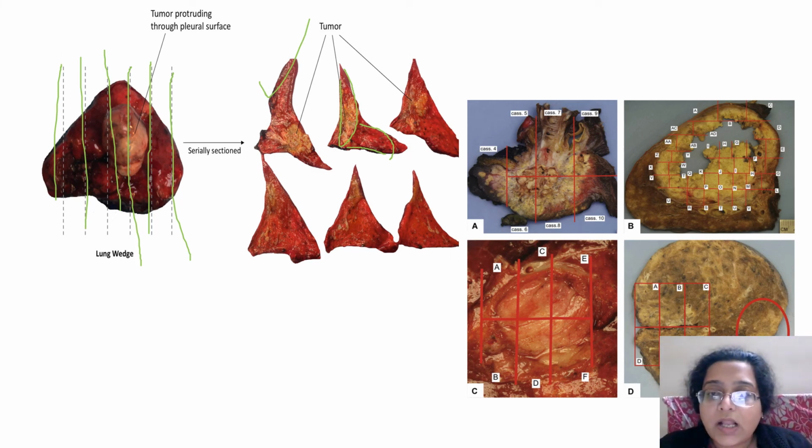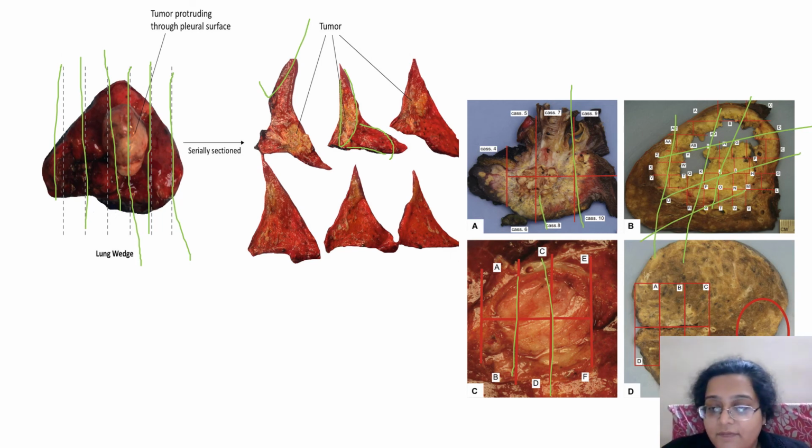Okay. Again, they've shown you a section where they've bread loafed it. There are multiple ways of taking sections actually. Mostly everyone is cutting it parallelly and then taking sections. What they've done here is first they have cut it parallelly, then they've divided it into multiple. So this is the basic, right? You don't have to copy paste it, but this is how you do it.